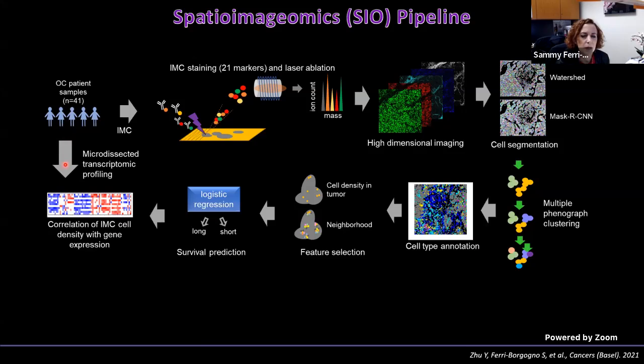And simultaneously, we also took advantage of microdissected transcriptome profiles from matching samples, and we correlated the IMC cell densities with the gene expression profiles.